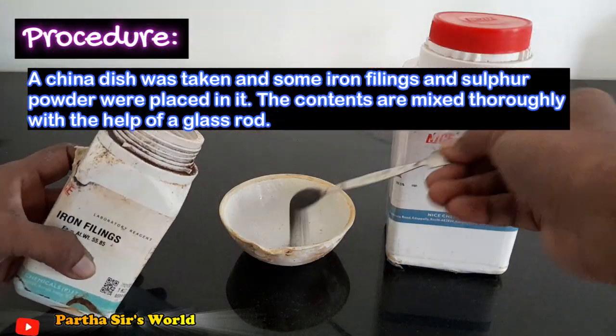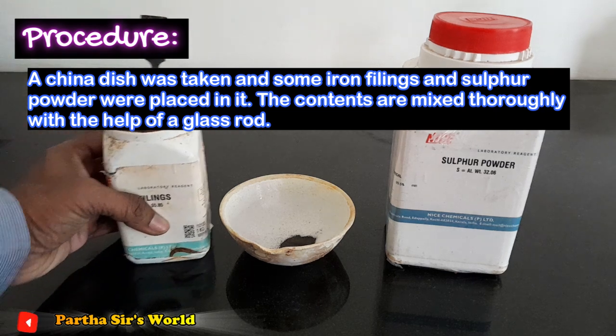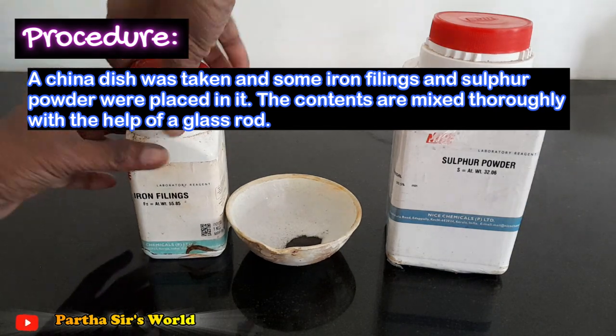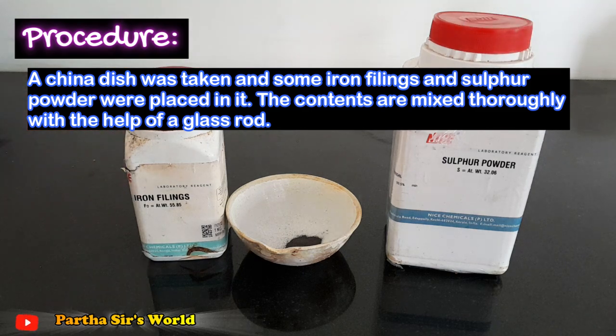Procedure: a china dish was taken and some iron filings and sulfur powder were placed in it. The contents were mixed thoroughly with the help of a glass rod.